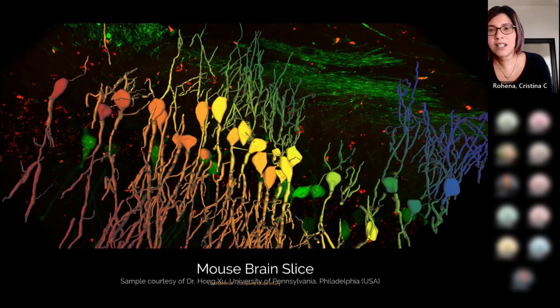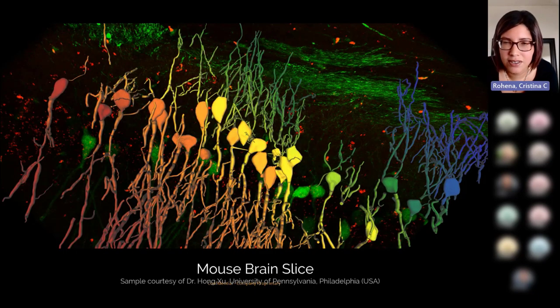Finally, this is essentially the same image I showed earlier of the YFP tagged mouse brain slice with the GFAP tagged cells. This was processed with our 3D neuron analysis in Aivia. You can see how you're able to track all of the neurites from the neurons really easily and quite quickly with the Aivia software in combination with Thunder, because this would have been pretty difficult to do on the raw image itself.